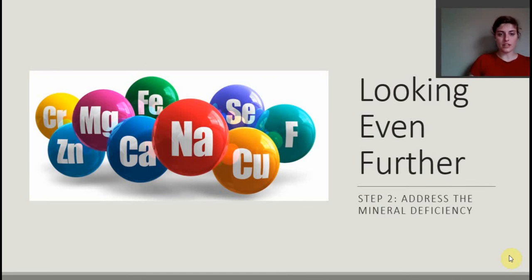Looking further, once the oxygen part has been tackled and overcome, the next step would be addressing the mineral deficiency that comes from the loss of the shell. The copper, the calcium, the phosphorus, and the magnesium are still not present when oxygen is allowed to come in and out. That would be the next step in investigation once the oxygen problem is surmounted.